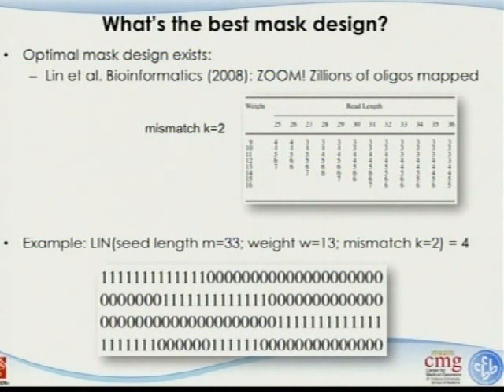I think this is a really interesting academic way to solve this problem, and this was published in 2008. Many later aligners use this type of strategy to design their mask matrix. So I guess this is a fun practice. We have the seed, we know the seed extension, and we know the problem. If you only focus on the seed, you run into trouble because you are not allowing nucleotide mismatches into the seed. Using this type of mask design can help us solve it.